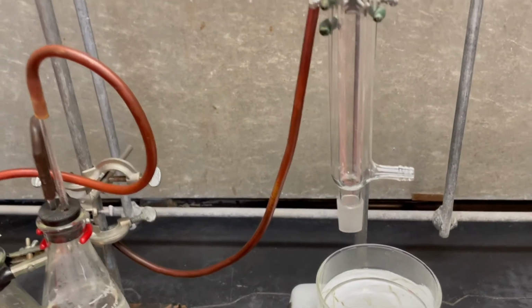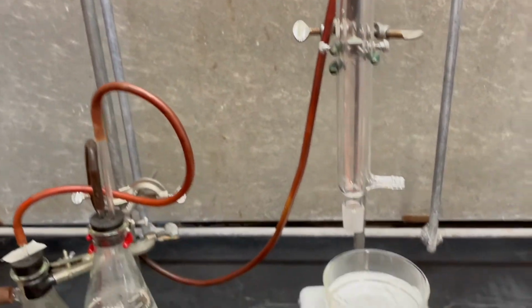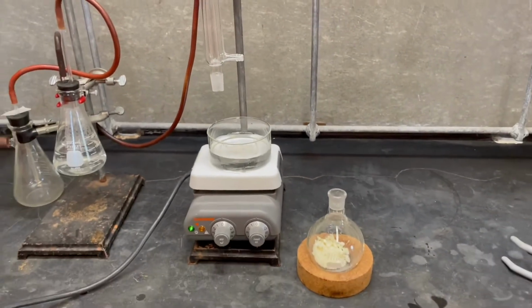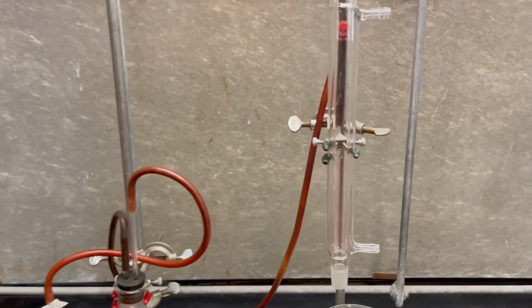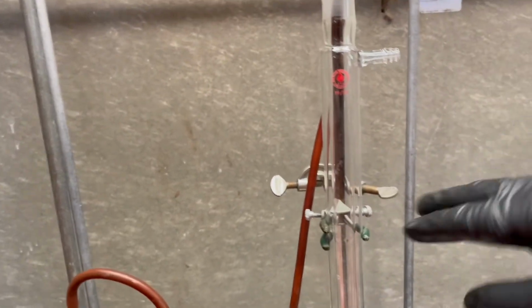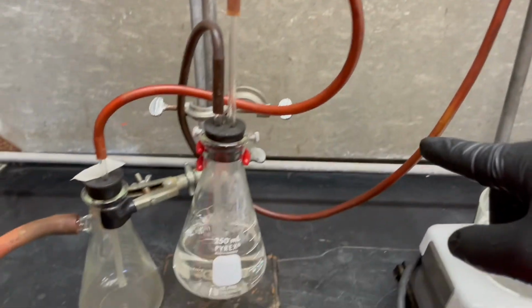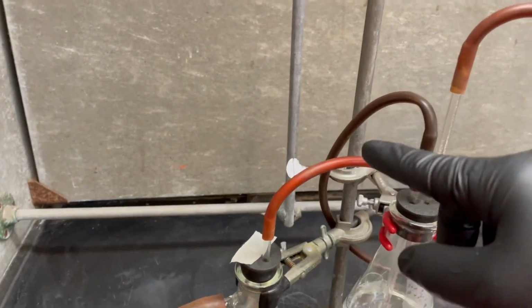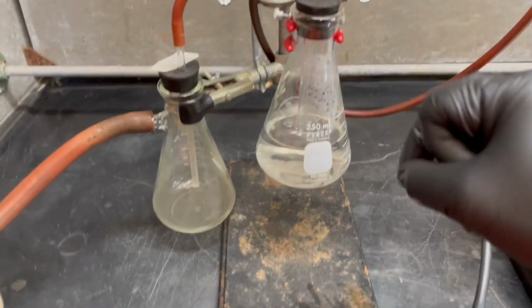Anyway, so this guy will be connected to here. Okay. So here's the thing. I told you nitrogen oxide gas will be evolved. So we're making LA smog, right? So that LA smog, we don't want to come out everywhere, right? So what's going to happen is it's going to come up and it's going to get sucked through this tube. Follow that tube, and bubble, bubble, bubble.